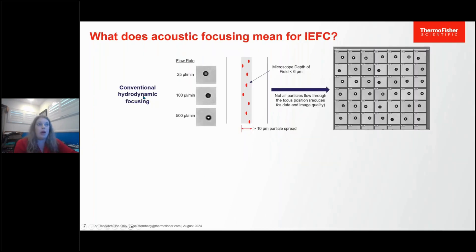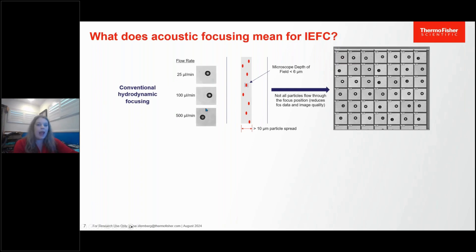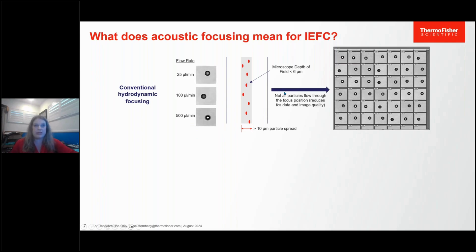A couple of words on acoustic focusing — it is key to the technology and key to why we can do image-enhanced flow cytometry on the Attune flow cytometers. With conventional hydrodynamic focusing alone, at low flow rates cells bop around a little bit, and at higher flow rates the cells are moving really fast through the stream, making it very hard to capture images. The images we do capture are very blurry and indistinct.